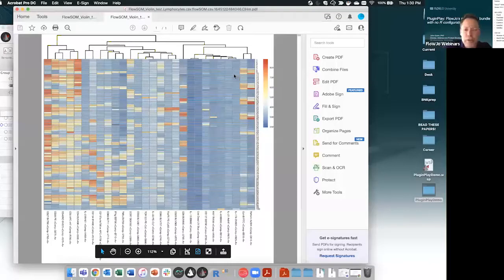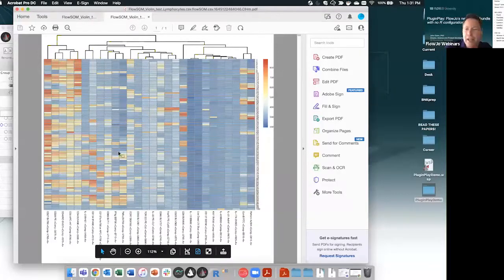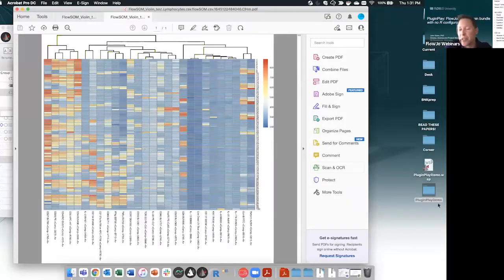And for the 100 nodes, generally a fairly unusable plot, other than to say, hey, was 8 a relatively good estimate of how many clusters there are? You can look through and just see if there are large groups and use the dendrograms for guidance, large groups of similarities. Like, okay, so here's a whole bunch of cells that look pretty similar for everything. And then there's a shift here where we see differences in expression of granzyme B and perforin. So maybe that should be like 1, 2, 3, I don't know, 4, 5, 6, 7, 8, 9, 10, 11, 12. I don't know, this all looks relatively similar down here, big sets of common expression, some variance across the board, mostly in TNF and interferon gamma, so you can expect that. Maybe I should have put in more like 20 as opposed to the 8 that I put in. I've probably underclustered this. So we could run it again if we want, using more like 20.